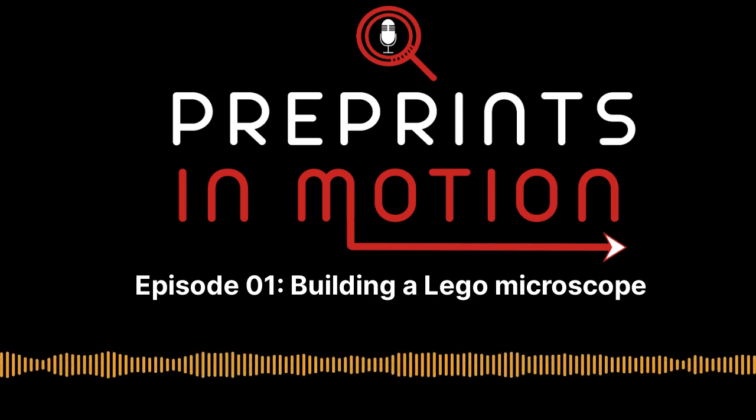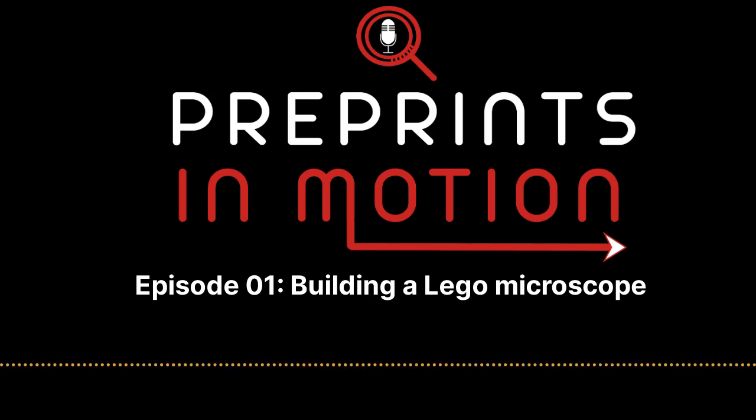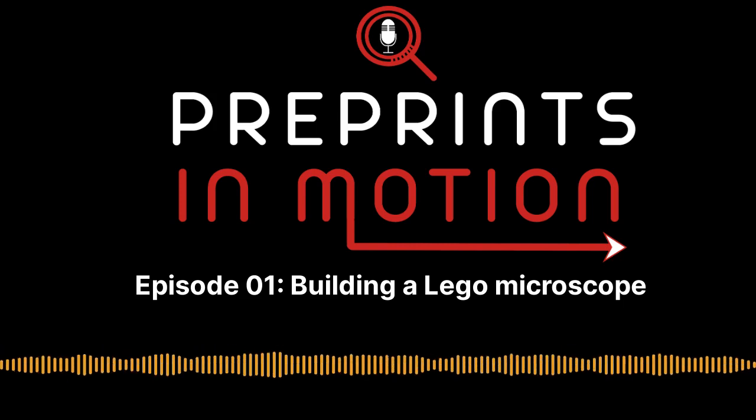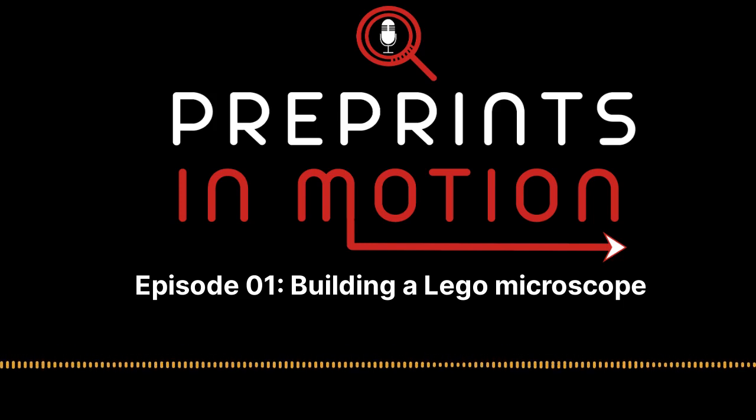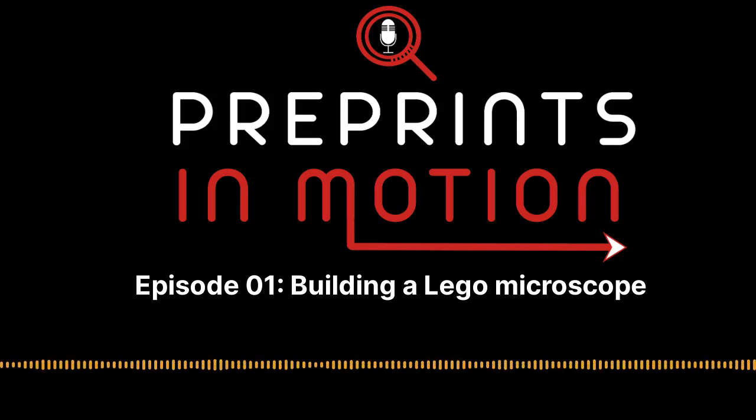Did you see the Lego light sheet microscope someone built? I think it was 2018. Oh yes, they are amazing. That was really cool. I think it might have been somebody in London who was part of that team. But yeah, that was super cool. And again, it is amazing for demonstrating what a light sheet microscope does, how it differs from normal microscopy, and for illustration, it is perfect. For basic experiments, it would probably be pretty good too.